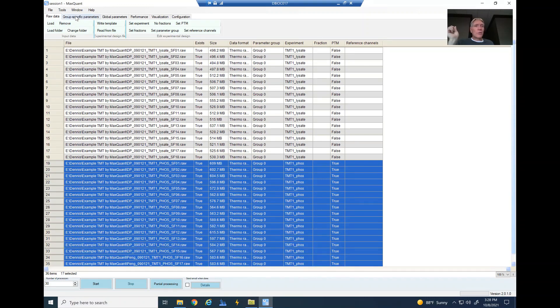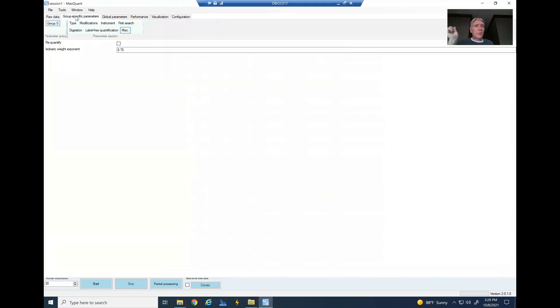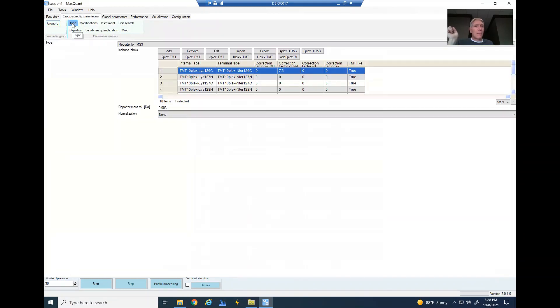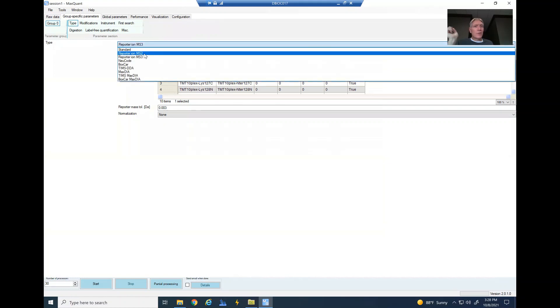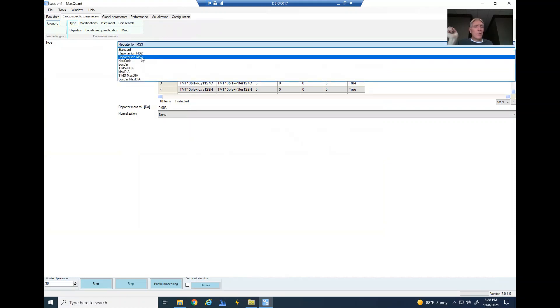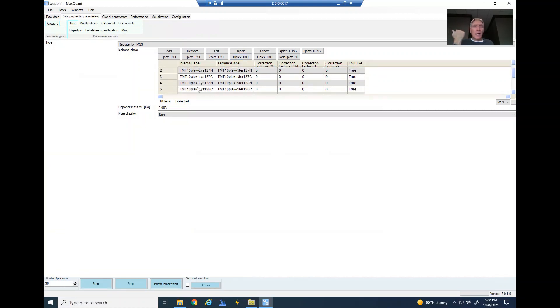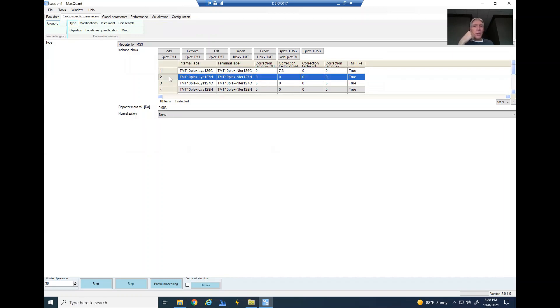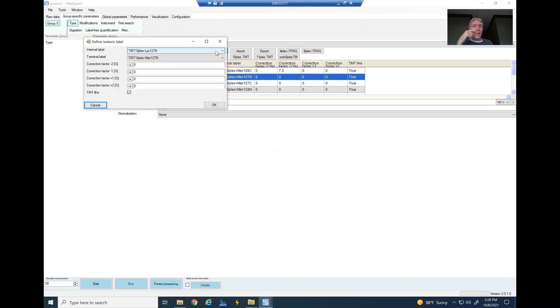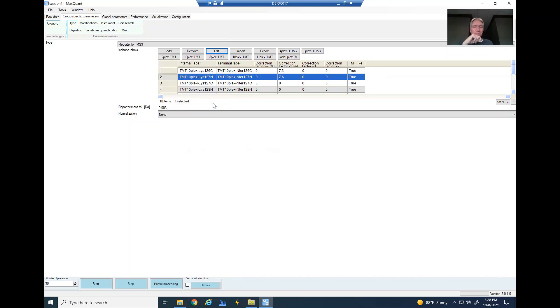So just to go through this real quickly again: group specific parameters, type—this is where I went from standard down to reporter ion MS3. Then I chose, this happened to be a 10plex. This is just an example here, but if I wanted to change this based upon that sheet that I showed you, then I could just click on one of these, go to edit, and then, let's say, this one right here is 7.6 or whatever for the ion 127, et cetera. So then you change all those settings like that.